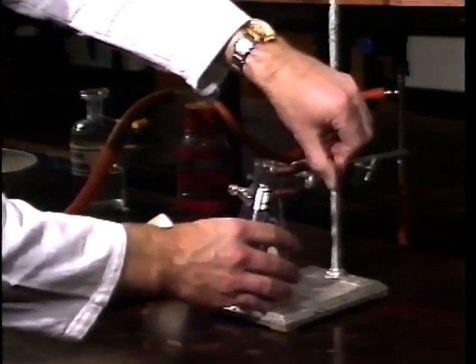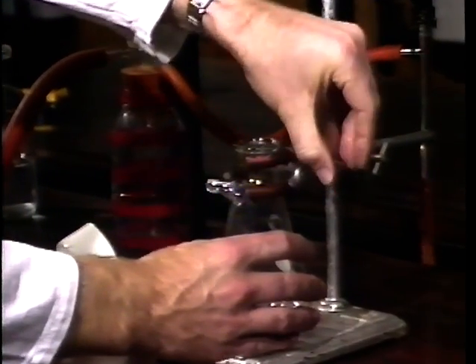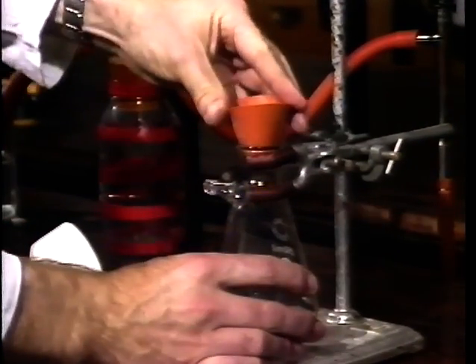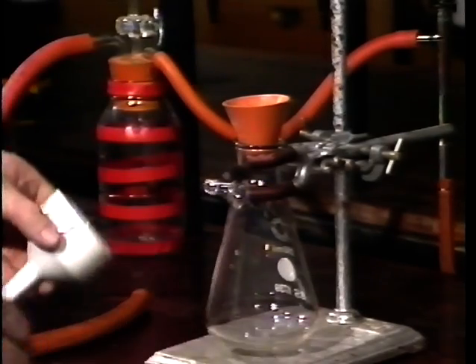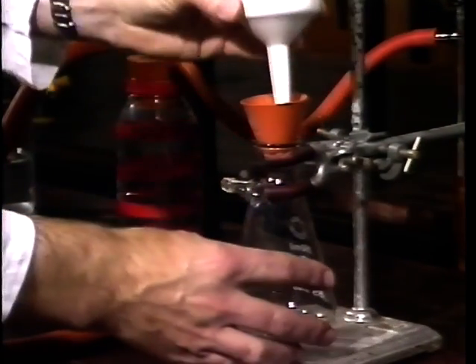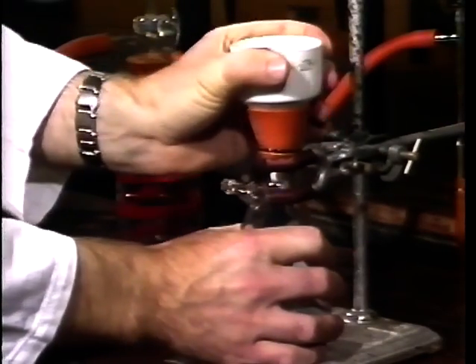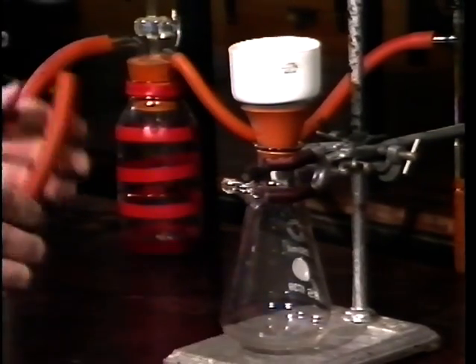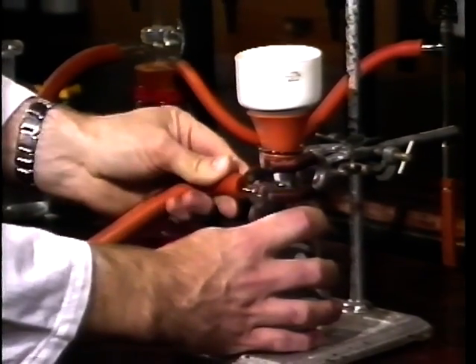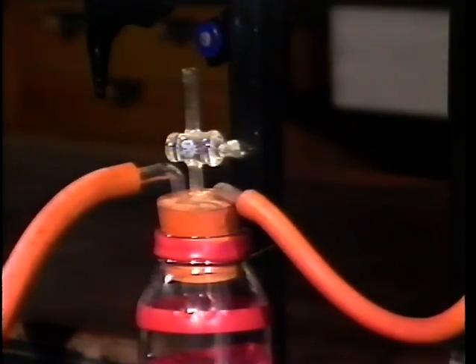Whilst waiting for the crystallization process to complete, set up a filtration apparatus as follows. Place a Buchner flask onto a clamp in a retort stand and put a rubber seal into the flask. Put a piece of filter paper of the correct size into the Buchner funnel and insert that into the rubber seal. Connect the Buchner flask to the water pump, ensuring that the tap on the trap of the water pump is closed.